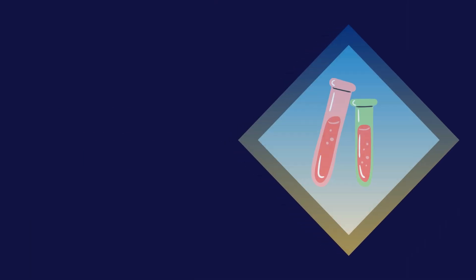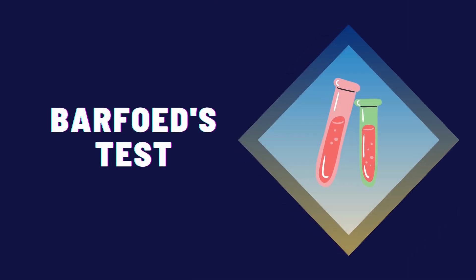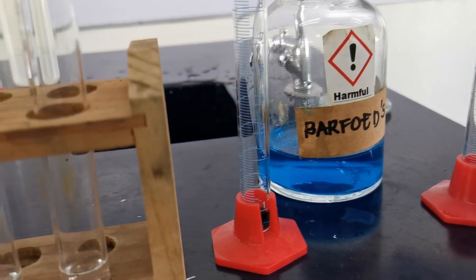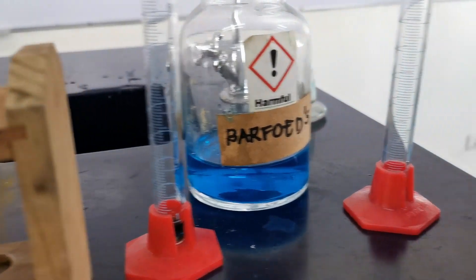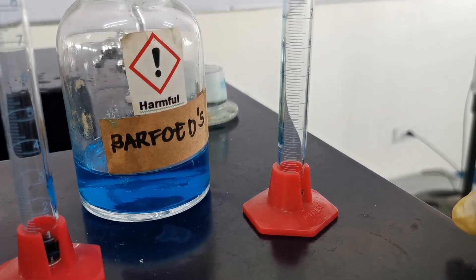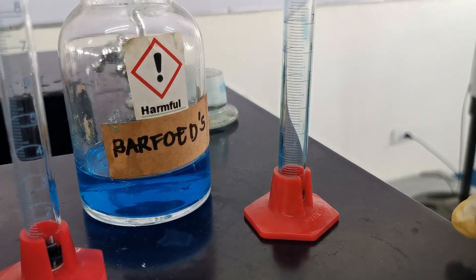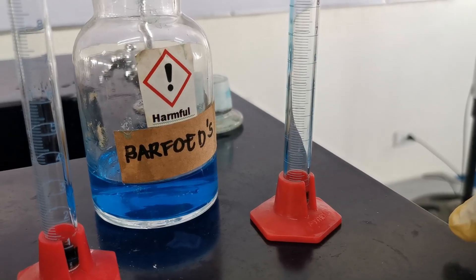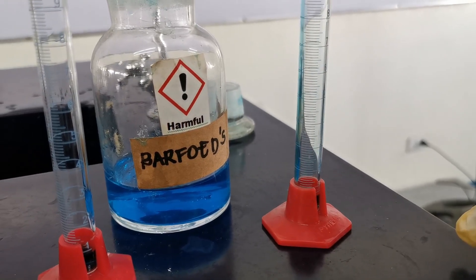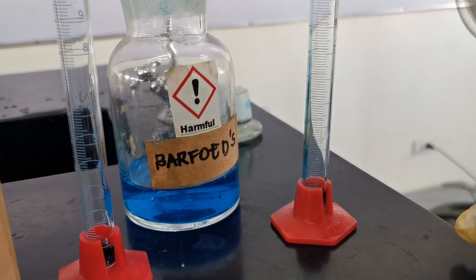Next is the Barfoid's test. Mix 1 ml of Barfoid's reagent with 1 ml each of the carbohydrate solution.